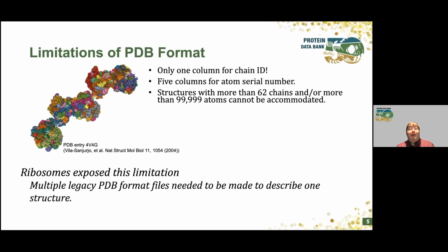So in early 2008 or so, we came up with the approach of splitting these into multiple PDB formatted files with multiple PDB identifiers and some instructions on how to put them all back together again. But this meant that you could not validate all the data together. You couldn't look at the whole picture at one time without loading multiple files.